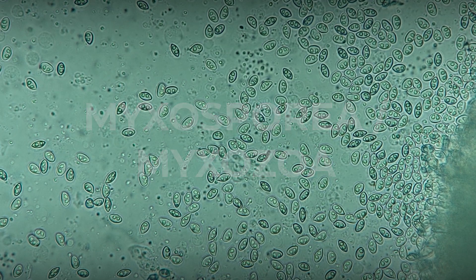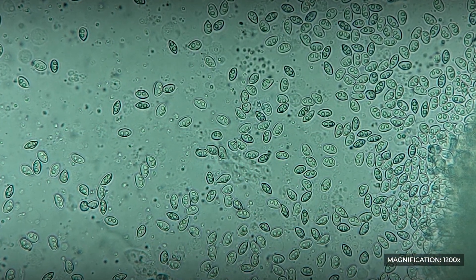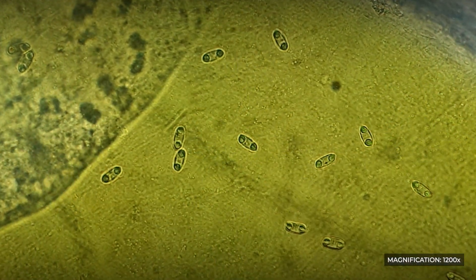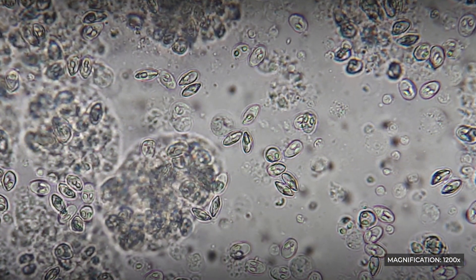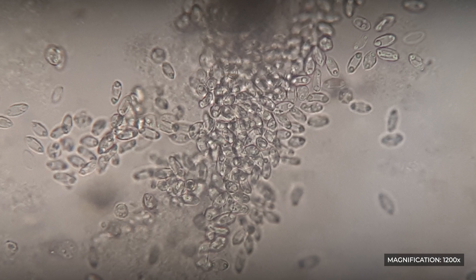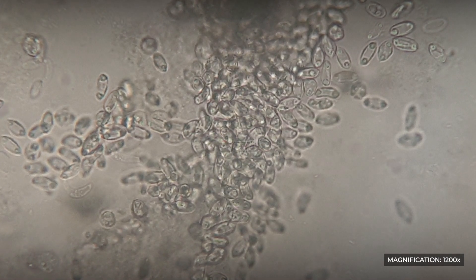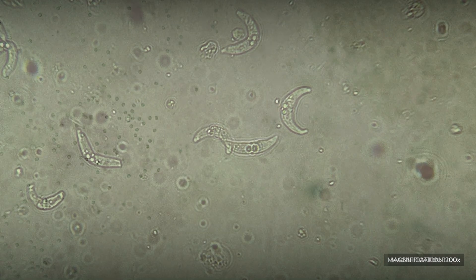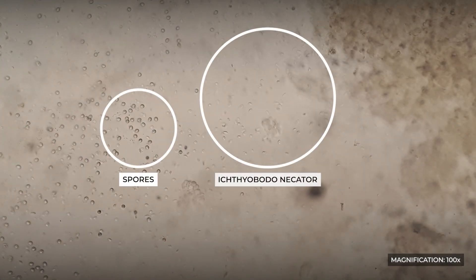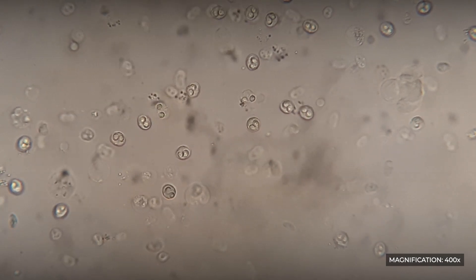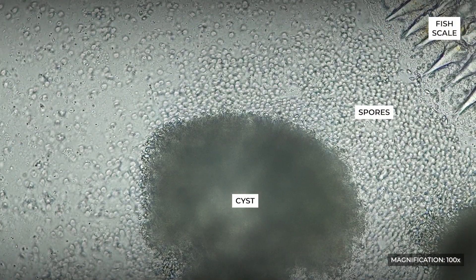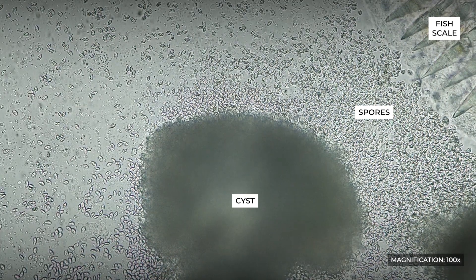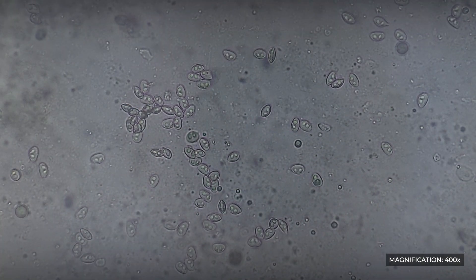Myxosporea or Myxozoa is a large group of spore-forming organisms, all of which are parasites, mainly of freshwater and marine fish species. The class Myxosporea encompasses several thousand species, and scientists are constantly discovering new genera and species of these parasites. For example, there are already more than 2000 species described in the genus Myxobolus. Myxosporea have a complex life cycle, in which after several developmental stages, spores are formed in the final stage.